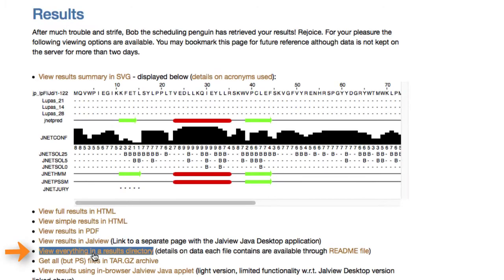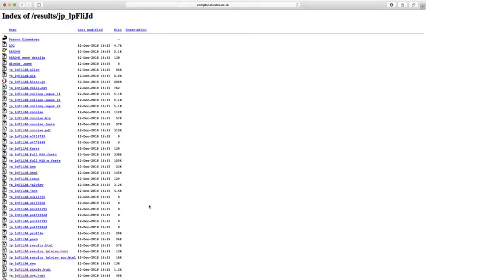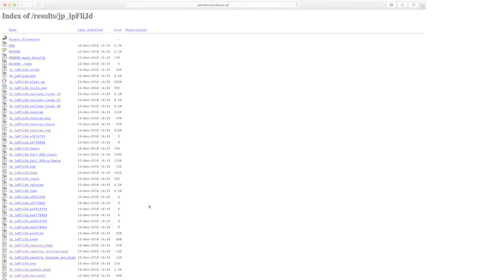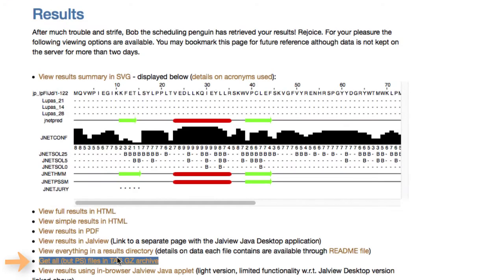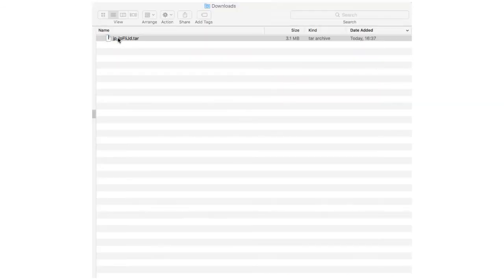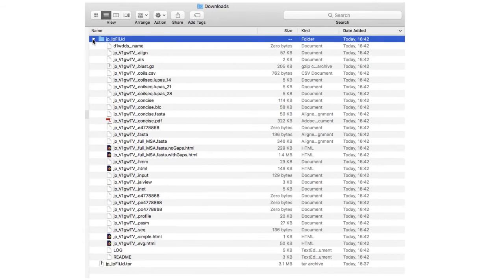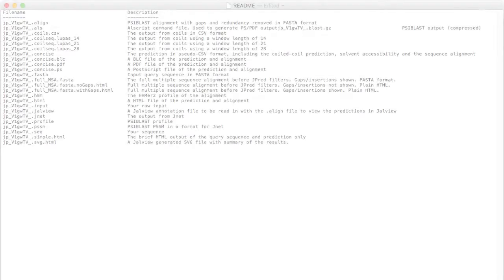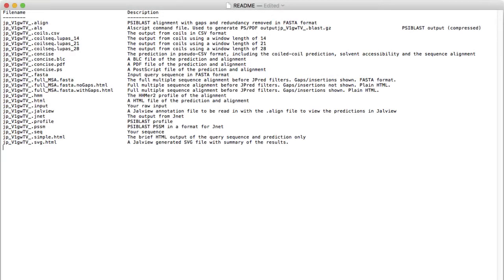All the files generated are listed in the results directory. These can be downloaded onto your computer. The README file explains what each file contains.